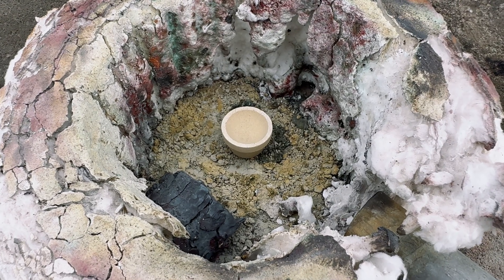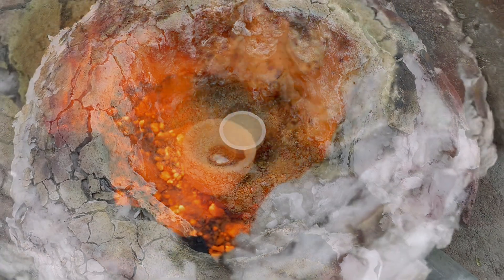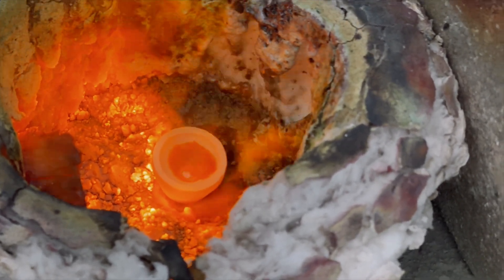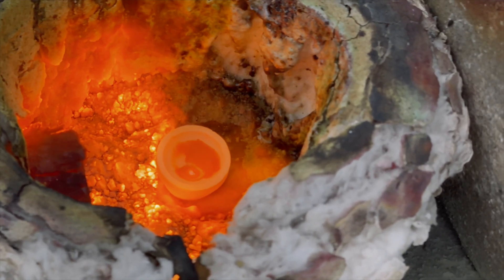We are using a 15-gram cupel for our 3-gram lead prill. I apologize for the shaky camera — the wind is blowing about 20 miles per hour.